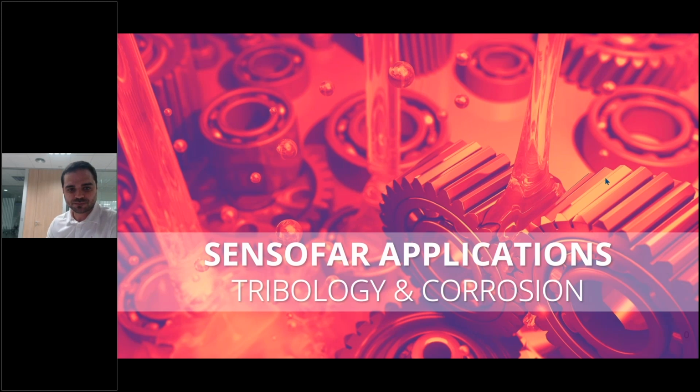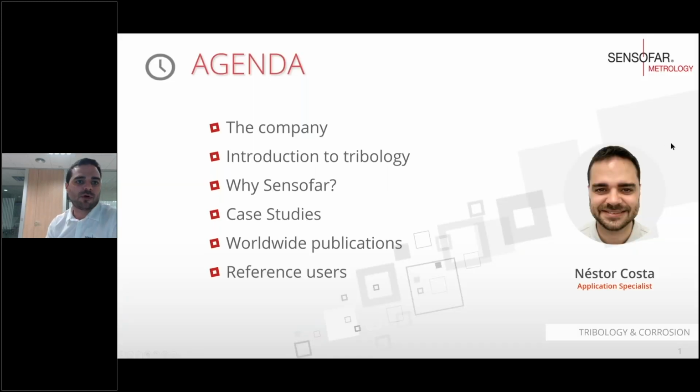Applications webinar. Today we will talk about tribology and corrosion, and we will explain how to measure and how to analyze this kind of samples with our 3D optical profilometer that we're doing here in Sensofar. So here you have a bit of a sum up about the topics that we will talk about today.